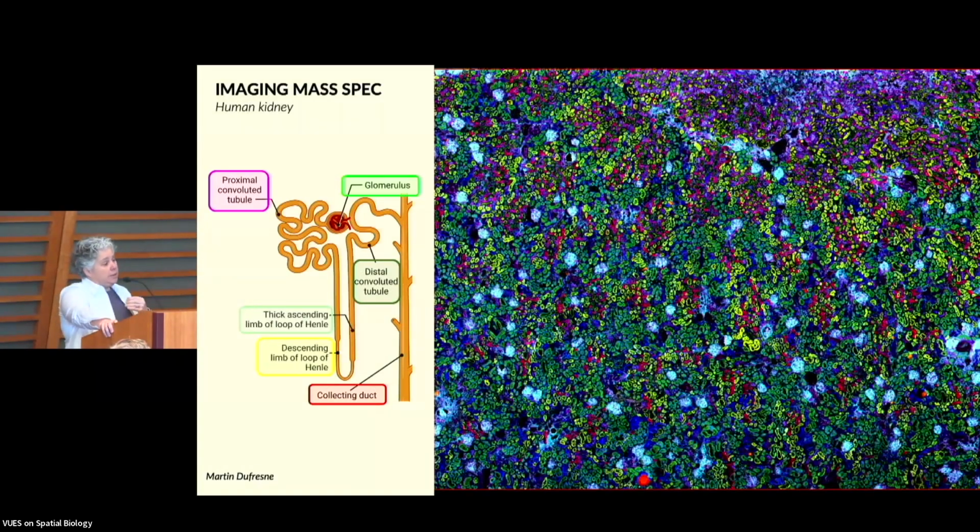And so now, instead of having to collect an MXIF image every time we do an experiment, we can just use that autofluorescence image to do the segmentation. And so this saves us quite a bit of time, money, and resources to actually segment our data.